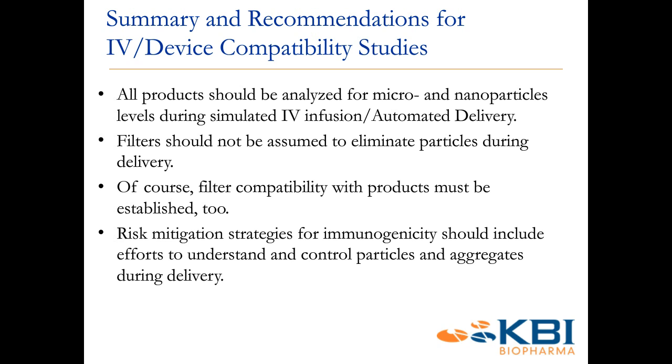Obviously, we have nanoparticles present that likely will not get filtered out, but we do have tools to help characterize those particles to understand could they be proteinaceous or related to silicon oil or other material. So you want to evaluate filter compatibility because we've seen some filters that could actually induce particle formation with certain products. But overall, risk mitigation strategies to help understand and potentially reduce immunogenicity of your product at the end of the day will certainly help both the patient as well as your product's success on the market.